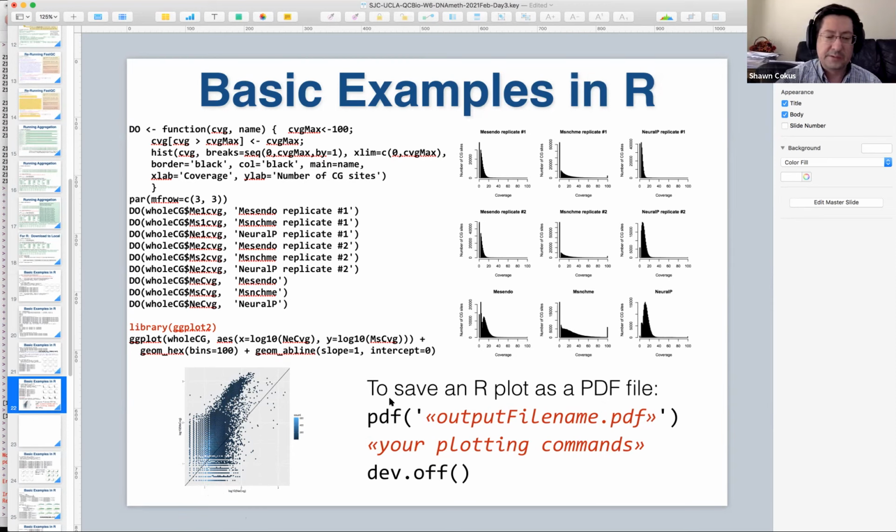So what happens is that the sites where mesenchymal does have coverage are higher than the neuronals, but at some point, it's probably hard to see here, you get this stuff down in here where the way that mesenchymal did that is by putting a whole bunch of guys towards 0. And there's the bright, these dots are like this. So it's like these black guys are hardly anything, and it's more like this blue stuff is where the stuff is. And there's the stuff down in here, and that's where mesenchymal is very low, and the neuronals are higher. So the neuronals are just more stable.